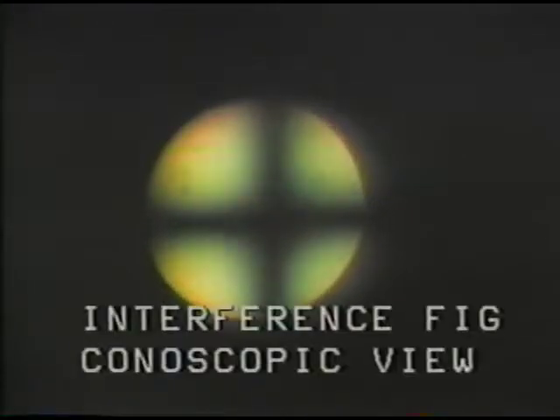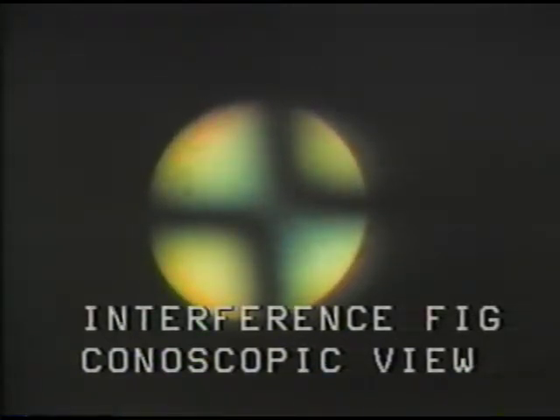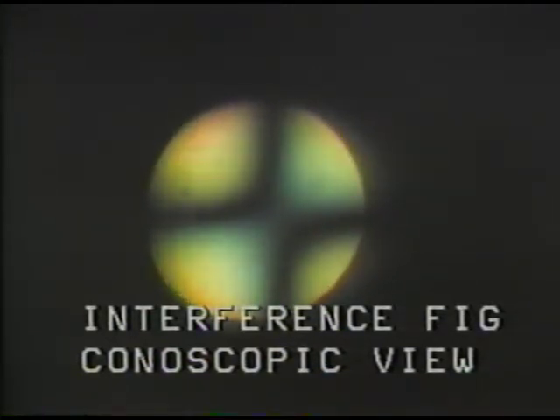So this is a very different fundamental way of testing optical properties of different minerals, and we'll get to know all different kinds of interference figures tested with the conoscopic method of observation of the microscope.